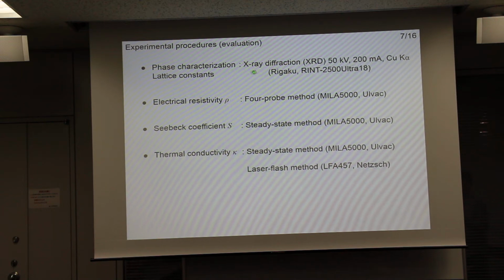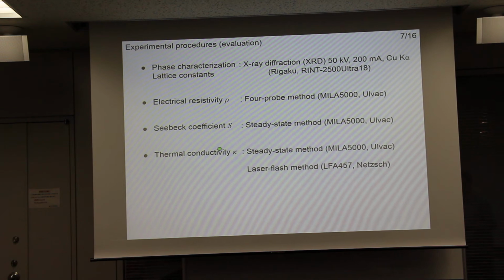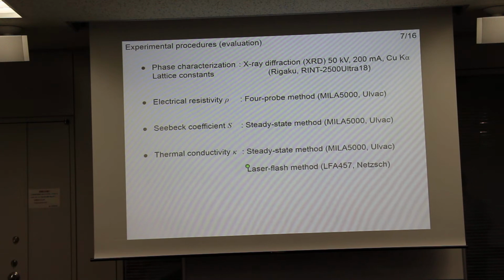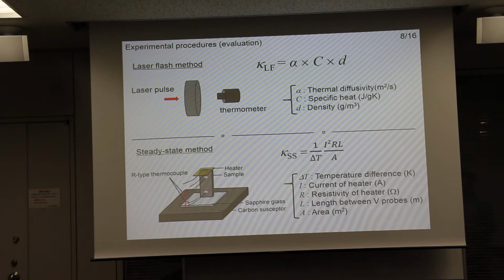I measured the X-ray diffraction as well as electric resistivity, Seebeck coefficient by a steady-state method, and thermal conductivity. But here, I measured thermal conductivity with two different methods, the steady-state method and the laser flash method. So I will explain briefly the differences.